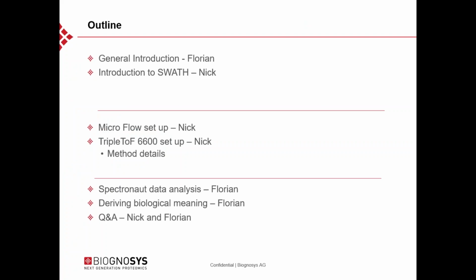The outline of today's webinar is that I'll present first a short introduction into the samples, this study setup, what kind of spectral libraries we used, and the overall strategy. Nick will then introduce the SWATH technology, talk about the microflow setup, give a little bit more details about the methods that we have used on the TOF 6600s, and then I will take over again to talk about the data analysis done in Spectronaut, looking at how we can actually derive biological meaning out of the proteomics data.